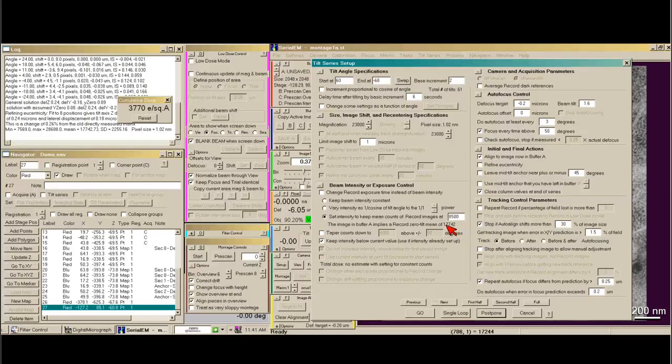If you're about twice as much at zero degrees as your target, that means at 60 degrees you should have enough beam to actually get 8,500 counts. I like to focus every time at high tilt, and every three degrees or so just force it to autofocus. We already have the center of our montage area in buffer A, so we're fine there. For safety's sake, I usually have it close the column valves at the end of the series. You can have it repeat the record montage if you need to, in case your area of interest fills the entire image. I always track before I focus, and I'm ready to go.